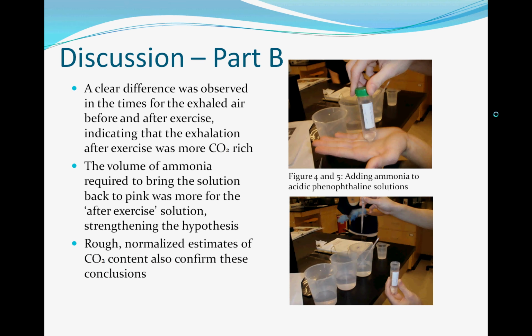So in Part B, a clear difference was observed in the times and the number of drops it took for exhaled air, as well as exhaled air after exercise and the room air. The volume of ammonia required to bring the solution back to pink was more for the exercise solution, which directly confirms the hypothesis. So it was shown, basically, that the exercise air did have a larger amount of CO2.